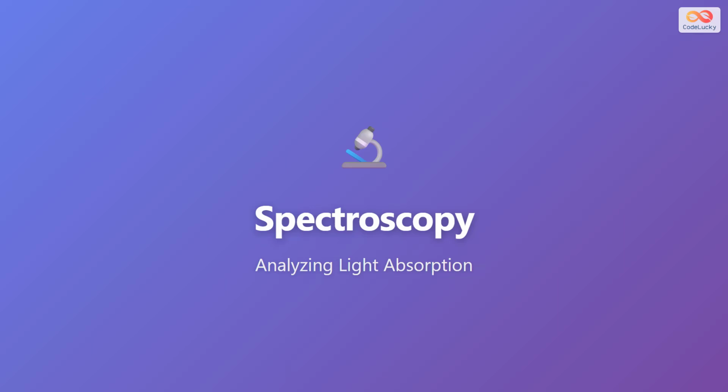Welcome to this introduction to spectroscopy, one of the most powerful analytical techniques in modern chemistry and biology. Spectroscopy allows us to identify and analyze substances by studying how they interact with light. This fundamental technique is used everywhere from pharmaceutical laboratories to environmental monitoring stations, and understanding its basics will open up a whole new way of thinking about how we can use light as a tool to understand matter at the molecular level.